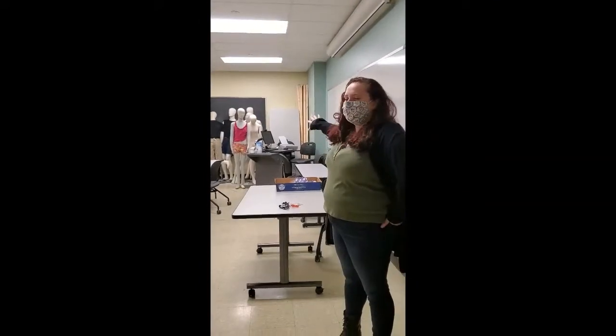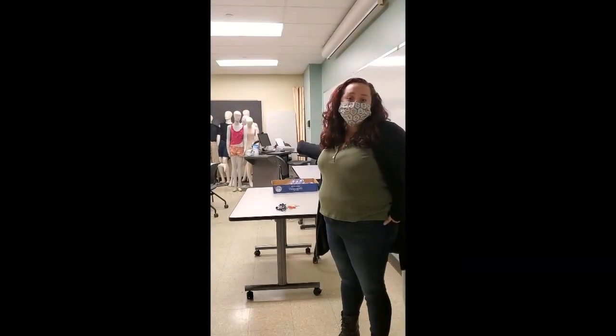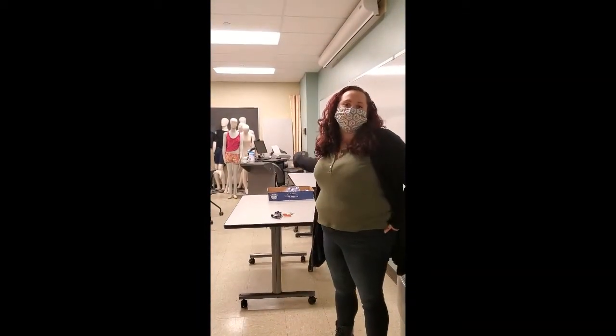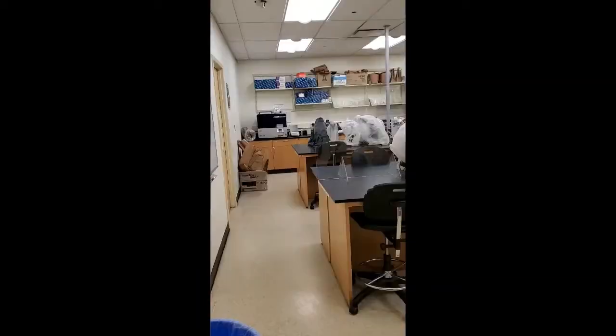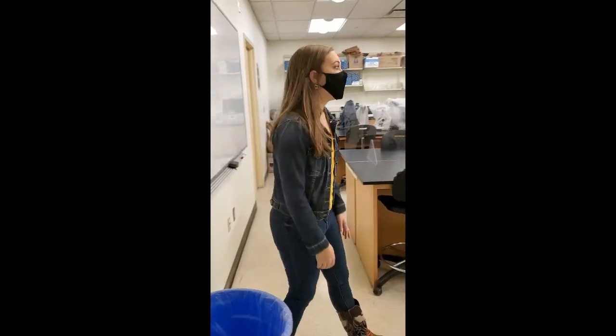And we have a whole bunch of mannequins over here because at the middle and the end of every semester we do mock crime scenes, which is basically us TAs come up with a crime and you guys have to solve it in class.